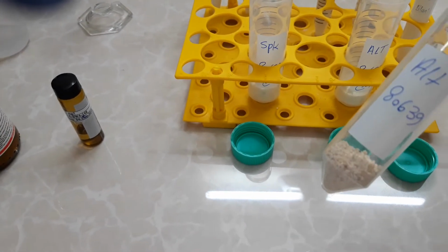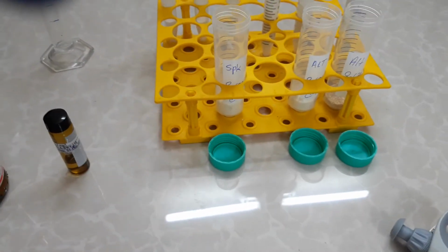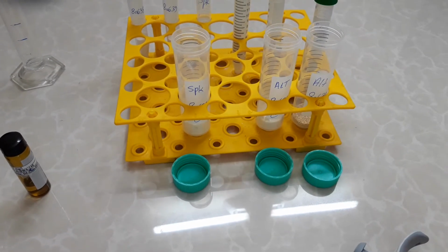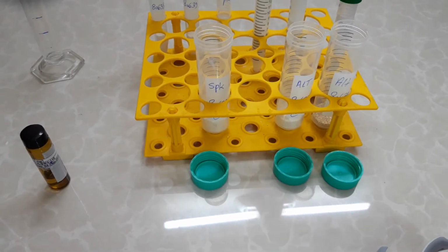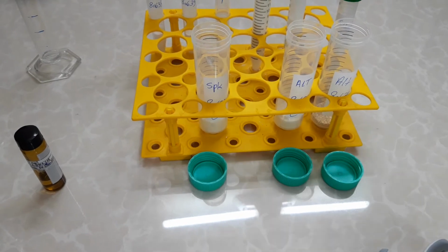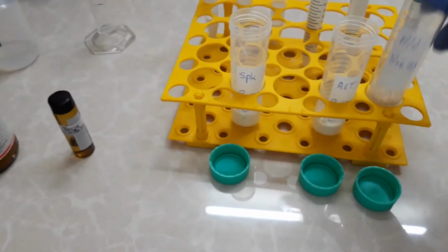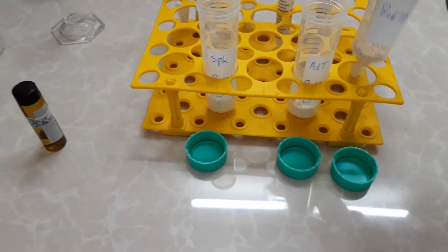You have prepared this sample by grinding it. It's good to mention that when you have a food sample, in the first step, you should put the sample in the freezer for about 30 minutes, and after that, grind the sample and weigh it, depending on the matrix that you have. For example, for cereals, we use 5 grams. For fruits and vegetables, we use 10 grams. This is a wheat sample. I have weighed 5 grams.